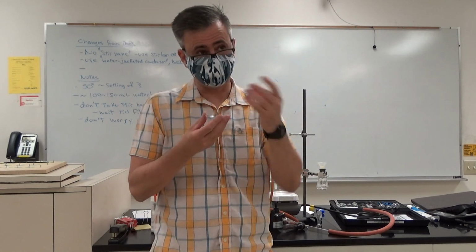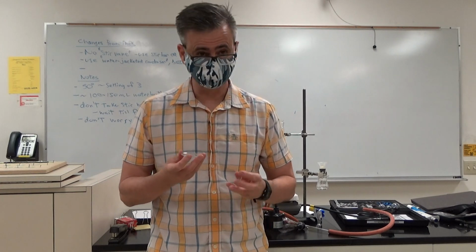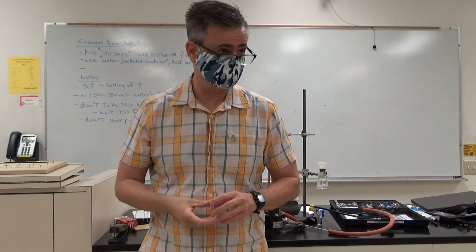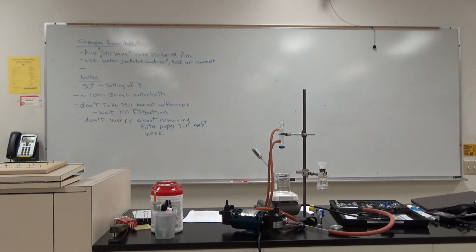Next week, take it all apart. We made sure which one was the bottom one, right? Okay? And then we can get that paper out of there, weigh it, do the subtraction from the empty mass of our bottom watch glass, and we know how much aspirin we made. Okay? Does that make sense? A couple more things and then we're done, guys. All right.